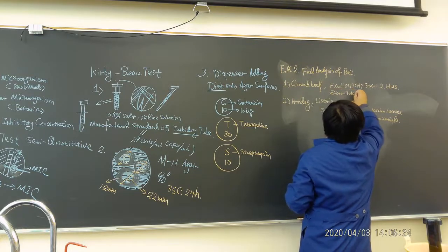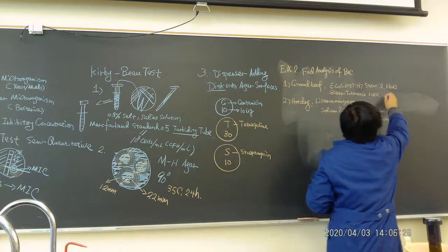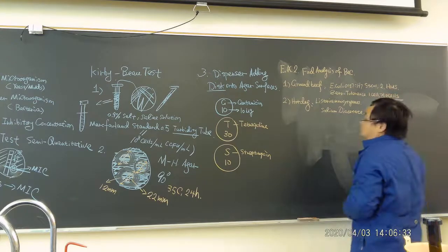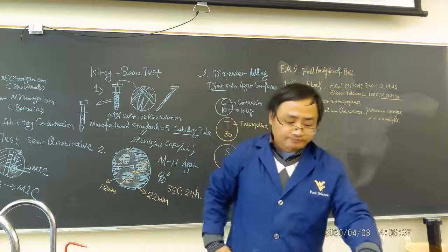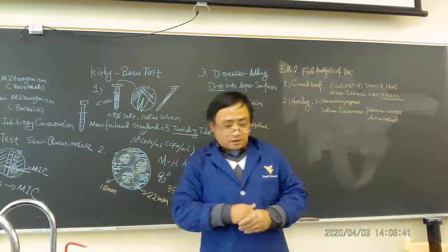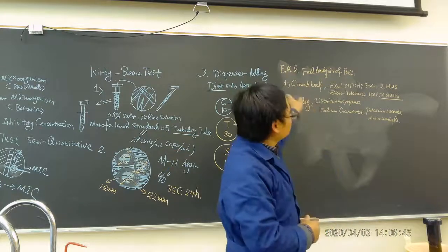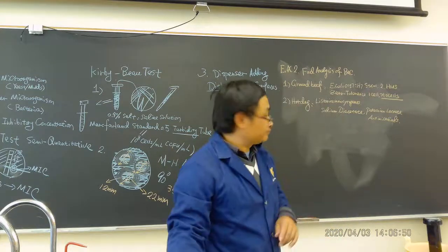This requirement is zero tolerance. You should not have even 1 cell. And if you have more than 10 cells, that's not good. This is going to cause people to die. Remember the lecture, what I talked about, the uncooked hamburger at Jack in the Box killing like 4 kids. That story comes from E. coli O157:H7. So I'm going to show you how we're going to do it.